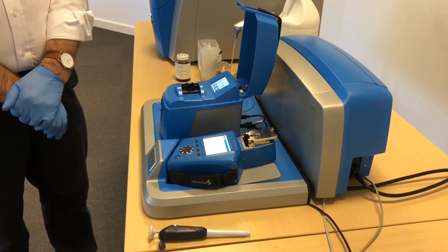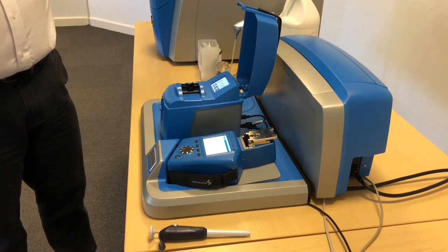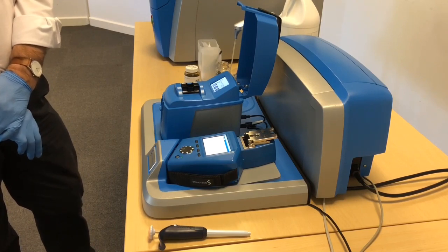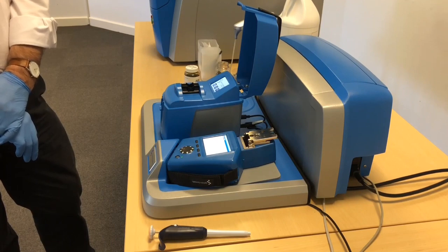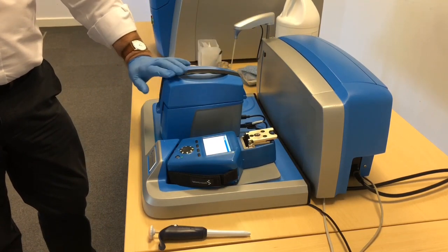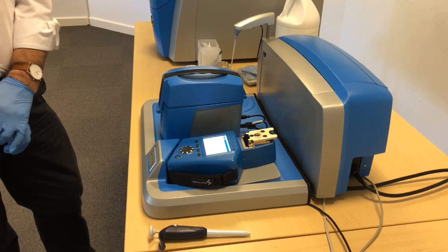If it's a very dirty sample, which, looking at this, I'd be surprised if it's clean, it's going to take a bit longer to flush, but we're talking of the odd minute here, not half an hour. So these units are now ready for the next sample, whatever it may be, that will be sent down from the TrueView platform by the system manager, ready to go.